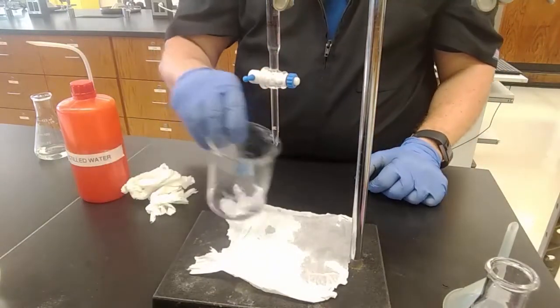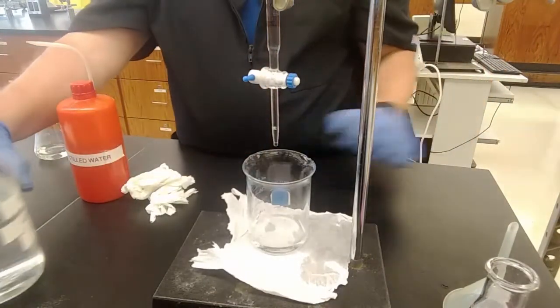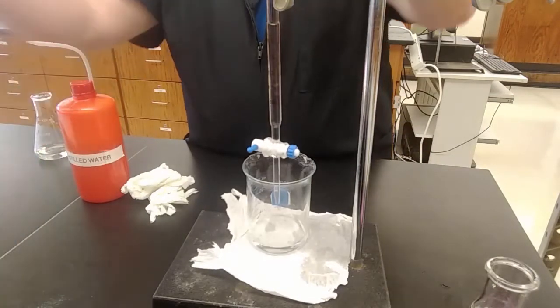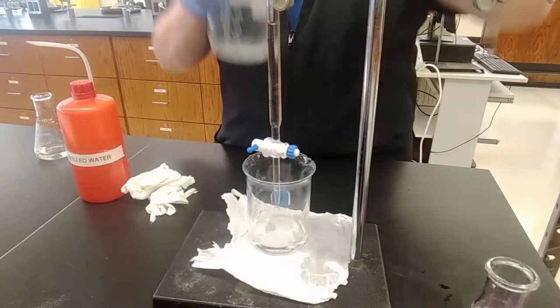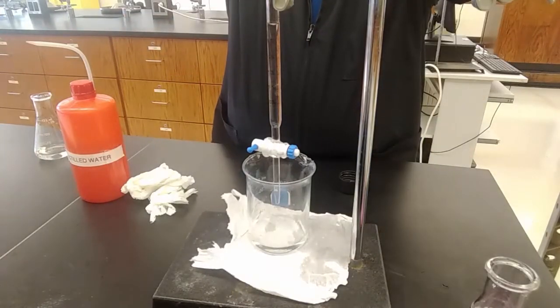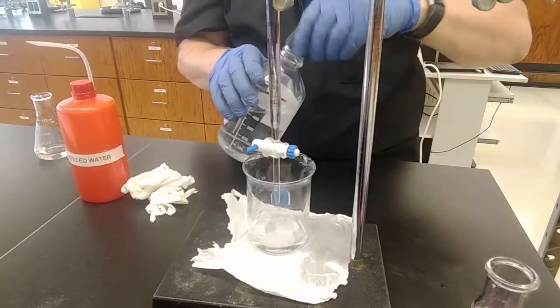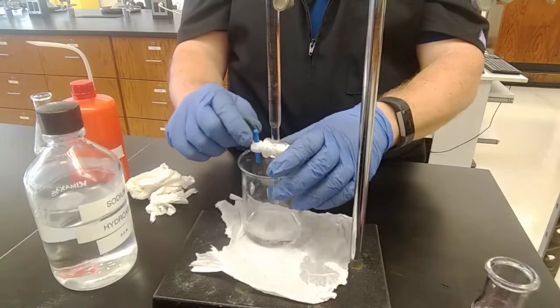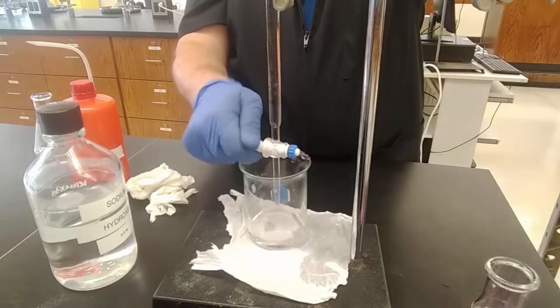Again, I need to refill, so I'll put my waste bottle underneath. I'll put my funnel back in. I'm going to lower it down so that it's as close to not pouring over my head as possible. And fill her up. Whoop! I actually did overshoot that time. There's still some left in the funnel, so I'm going to turn it on, let it drain out. And there we go.